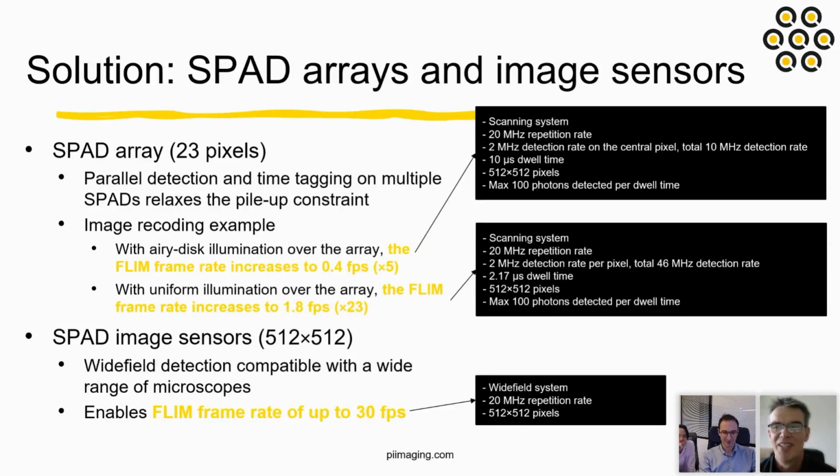for your responses from. But in answer to your questions, the first question was, this is single photon sensitive, not single photon counting. Is that correct? So you can't know if 3 photons arrived in a unit of time. So if you talk about 1 pixel, this is correct. Here we are talking about SPAD arrays, so this is incorrect. So if you distribute light over multiple pixels, then we can differentiate between 0 all the way to the number of pixels representing the maximum number of photons that we can capture at the same time.